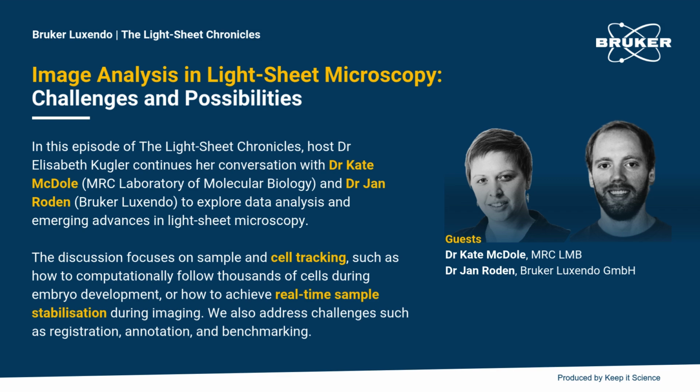If the data of the different views is not well aligned with each other, then the fusion doesn't make sense, because then you won't be fusing basically the corresponding points in the sample, so to say. And for example, with these applications that Kate described, I can also imagine that if you want to keep tracking cells, and now they are moving into part of the sample where the other view would actually be better, then you need to somehow have a very good, accurate registration between the views, so that essentially the tracking can continue in the other view, so to say, if that makes sense.